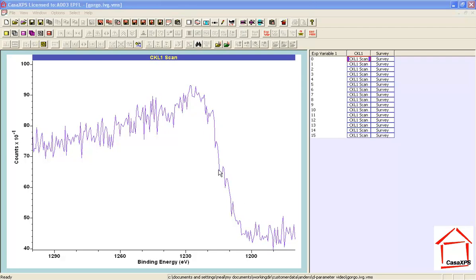Then we can differentiate the individual components within the peak model to produce an overall derivative for the data that is far more precise than if we simply used the Savitzky-Golay method. The peak model that will fit these data is not intended to be physically meaningful in the context of carbon Auger signal. It's simply there to create a smooth curve that approximates the data.